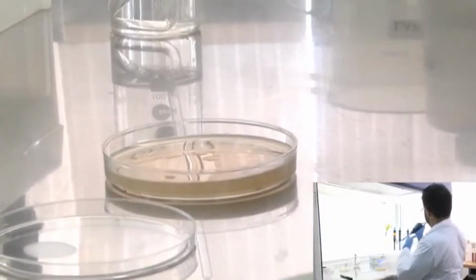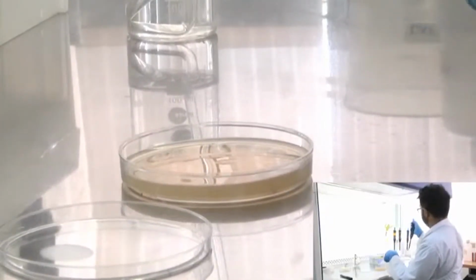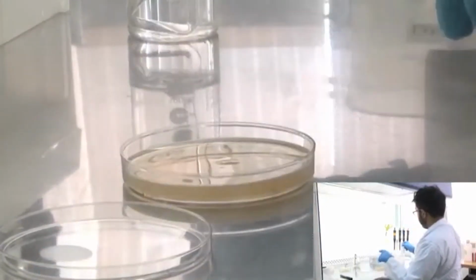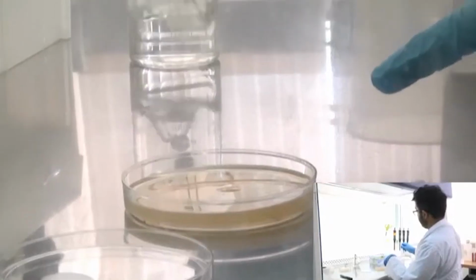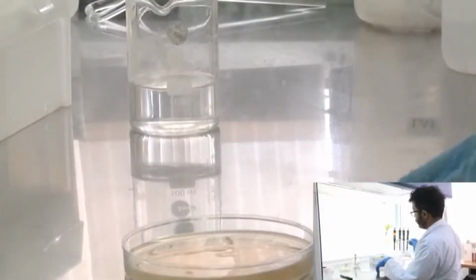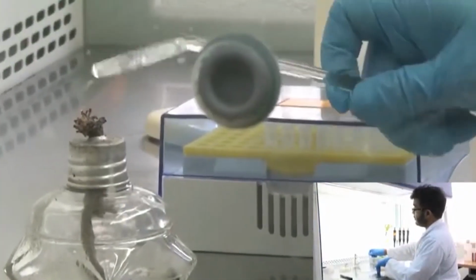Do not just scatter it all over the surface, because you need to keep the surfaces of the plate devoid of bacterial culture, because initially you are going to help cool your spreader by touching those surfaces. So you don't want your bacterial culture to be there and get killed by the heat.